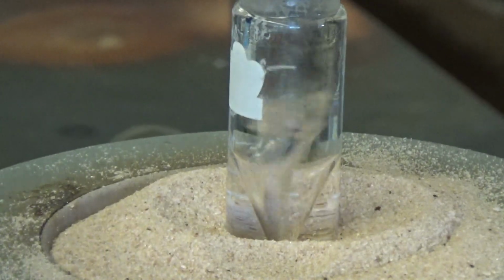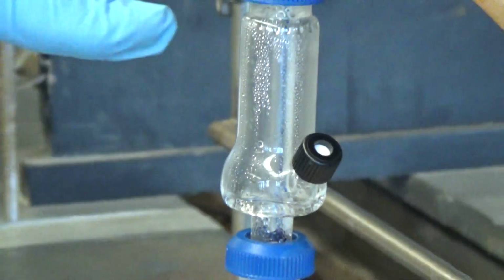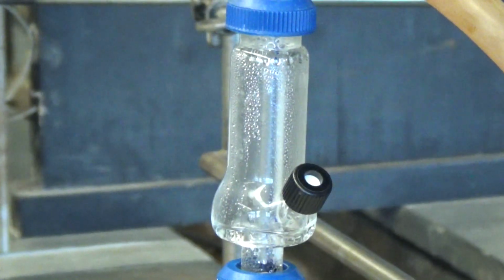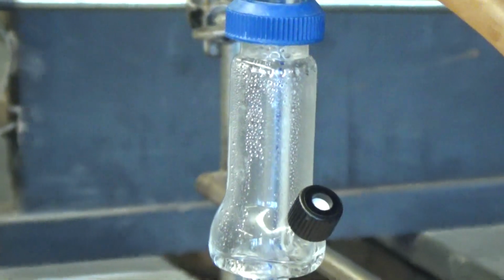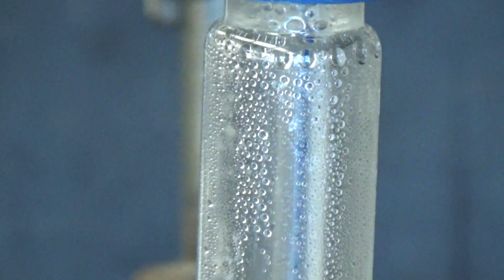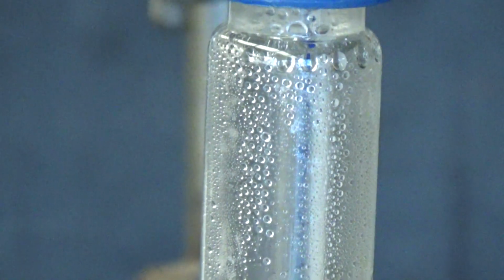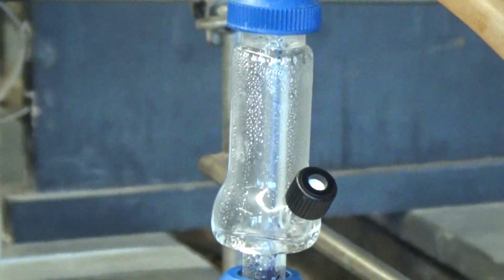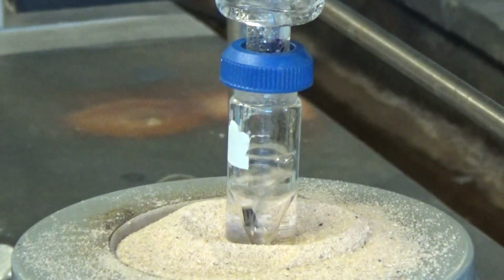And you see condensation, we collect a lot here. You see the condensation process. It's a cool experiment. I like it because you're actually making a new molecule. The mechanism's pretty fun. They should be able to understand the mechanism because they know something about mechanisms. They're not experts yet, but it is a followable mechanism for them, and that's really cool.